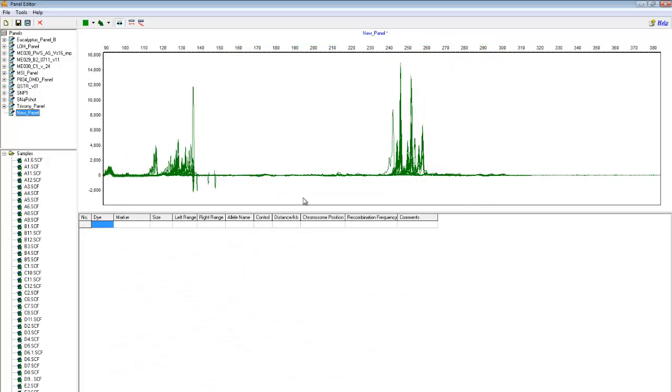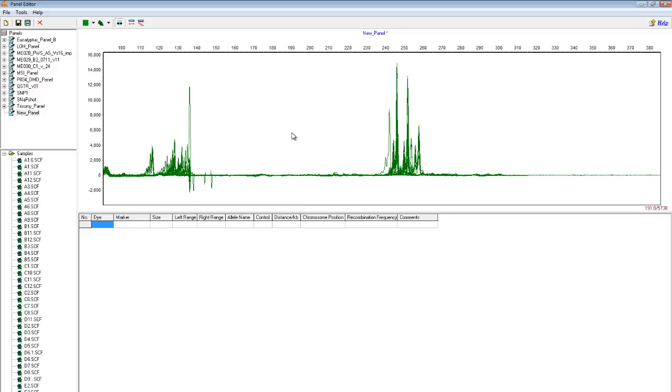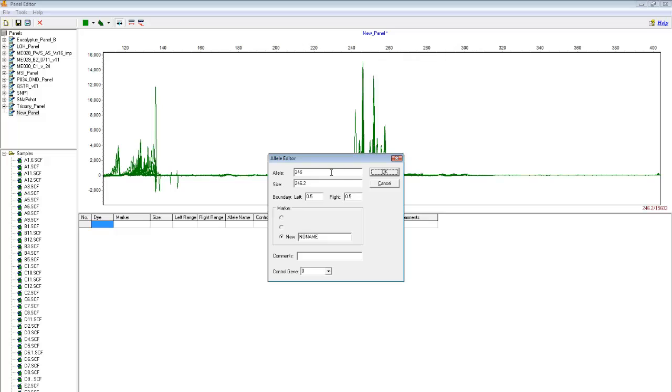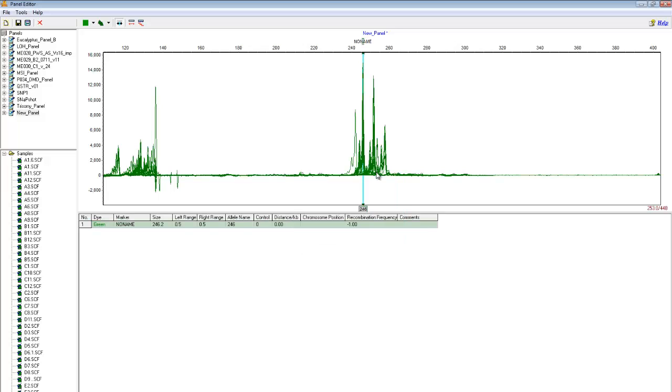Manual panel creation is essentially exactly what it sounds like. Alleles and markers are individually added by hand. To insert an allele, just right click and then select Insert Allele. You can give the allele a name, its size, the bin width, the accompanying marker name, or enter any comments. When you've entered in these fields, just click OK. Now we can see that the allele has been successfully added.